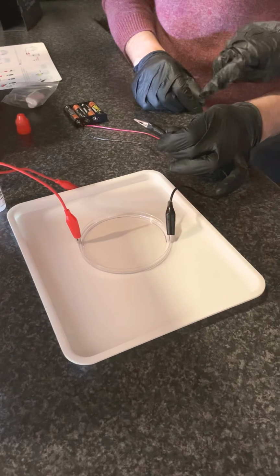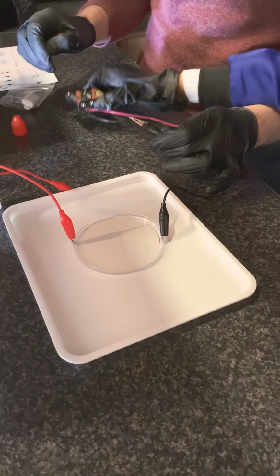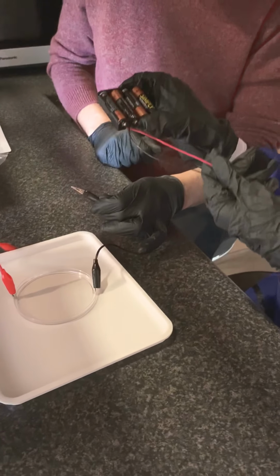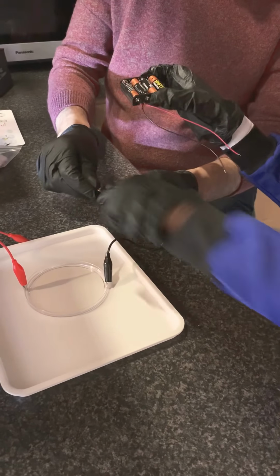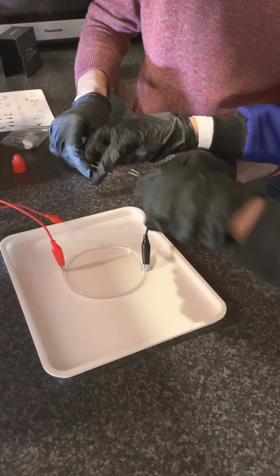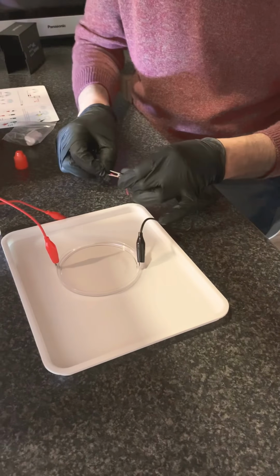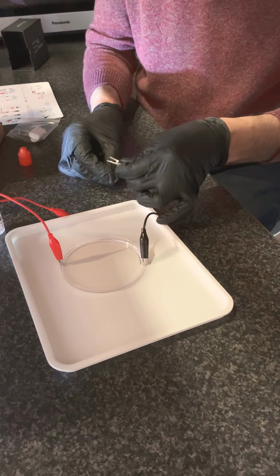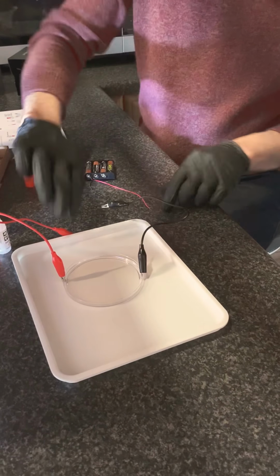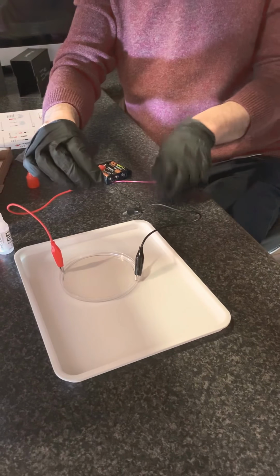Now you need to insert all of your AAA batteries into the battery holder. And then you'll need to attach the crocodile clips to them. Make sure the black one goes with the black and the red one goes with the red. But you have to remember that they can't touch each other, or otherwise you might have a problem with the experiment.